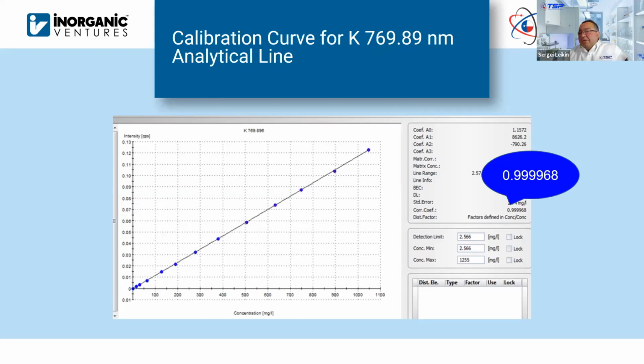And now moving to the last point of the common problems in this presentation. I'm sure there are many. So your QC did not pass. What is the first thing to look for, and there are a number of reasons. We get good calibration curves, and this is an example showing up here, and we get very excited, everything looks great.